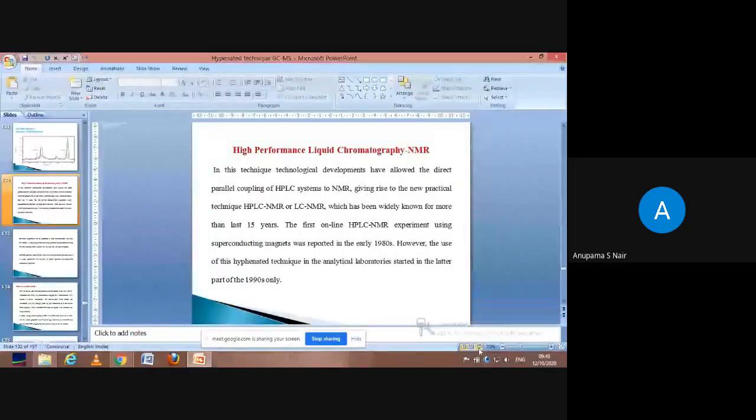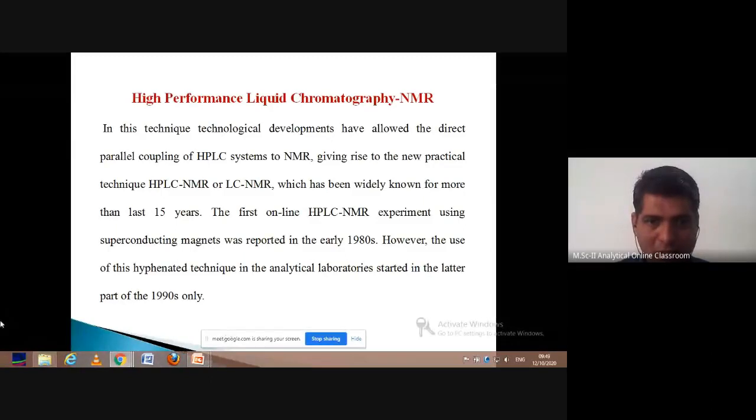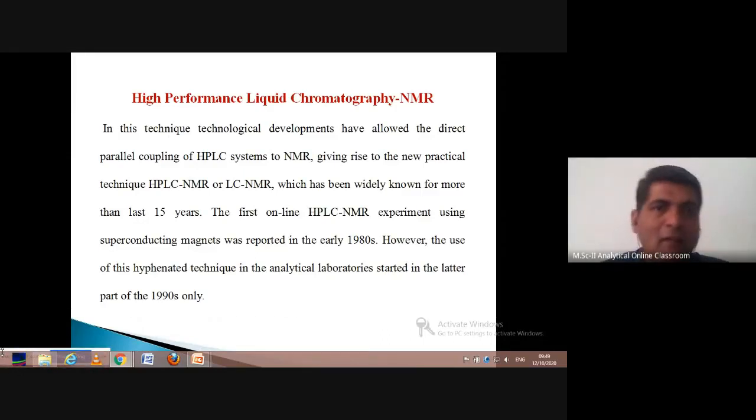Yes sir. Okay, good. As you know, in the last lecture we were talking about the new technique, HPLC NMR. HPLC stands for high performance liquid chromatography, and you know what NMR means. This is a new technique which has great application in pharma, biological activities, and analysis of complex mixtures. So it is a very important technique for the analytical chemist.